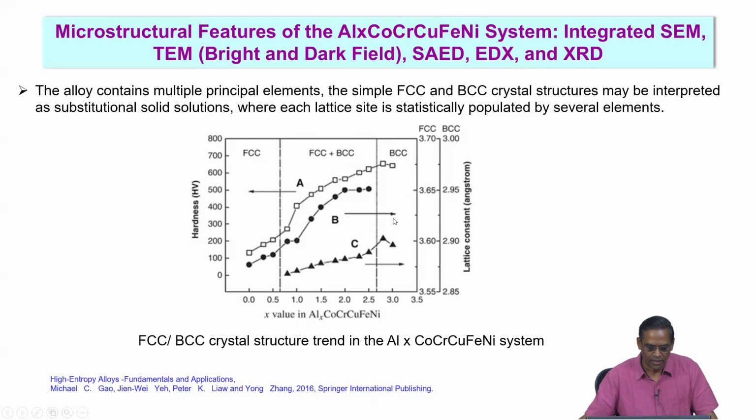So when you have these kinds of multiple principal alloying elements, how do we understand the microstructural features? We will integrate all these techniques: SEM, TEM, selected area electron diffraction, energy dispersive spectroscopy, and X-ray diffraction, and then see how best we can understand this system.